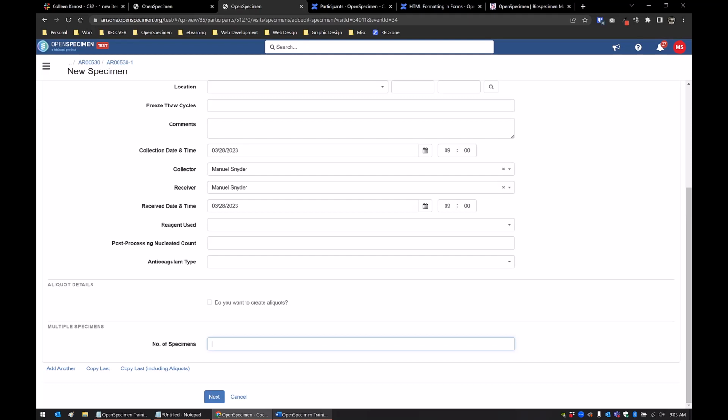And some groups are using first name, last name for MRNs and things like that. So I would have to get you the dictionaries for your tables so you know which fields refer to what data. Okay.